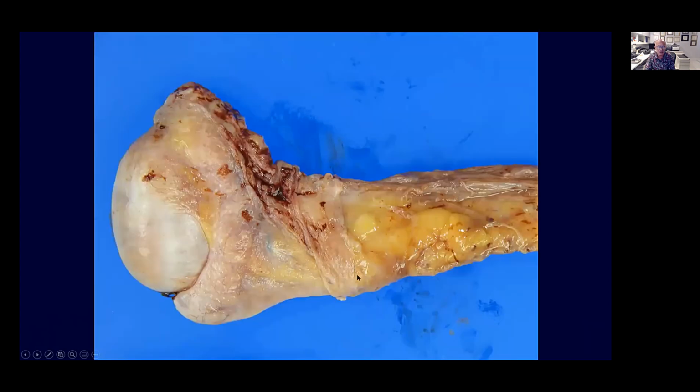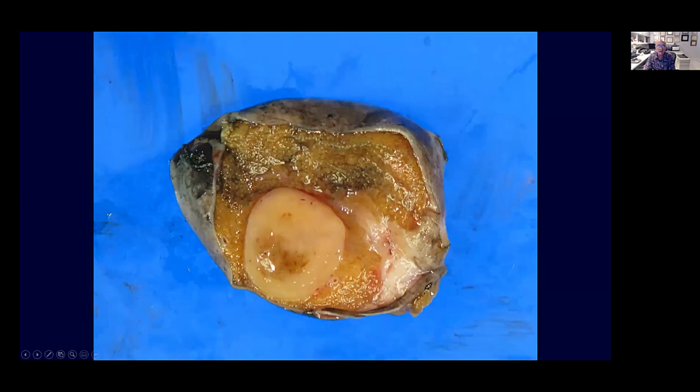This is a specimen here. It was taken with an external view, and then the internal view of the section where you see this well-defined tumor with what the classical definition calls a fish flesh appearance. We always compare things with food in pathology, but someone compared the appearance of these tumors with the flesh of the fish, and you can see this very well circumscribed tumor, which is typical of a seminoma.